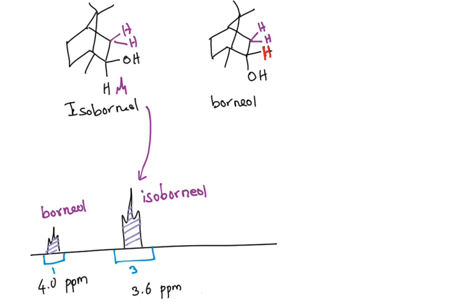Okay, so there's one more question on the post lab. Why did you use a solvent for the IR spectroscopy? The IR spectroscopy works like this. You have a sample platform. You put the sample on this platform, and the IR light comes from this side. Here's the IR light source.